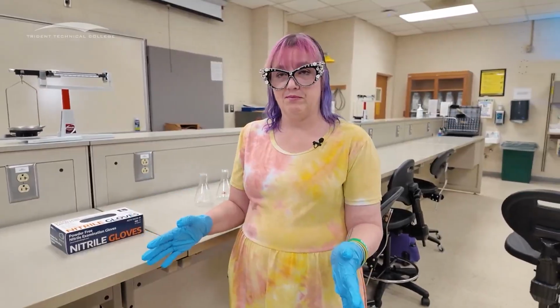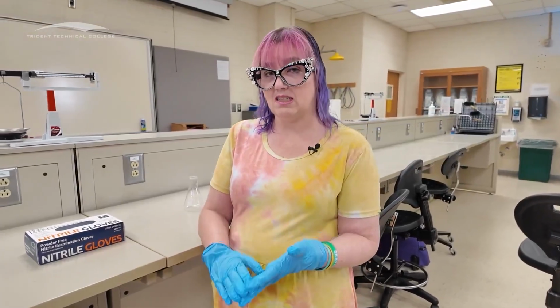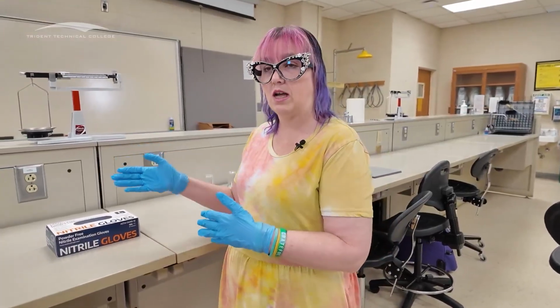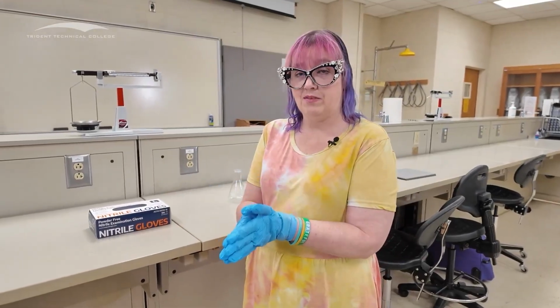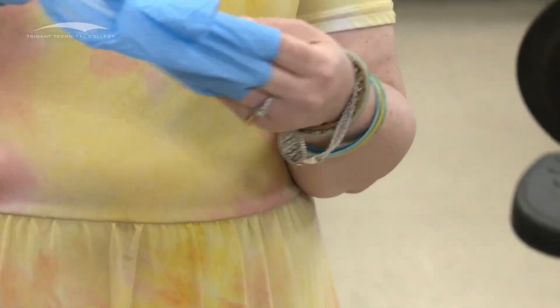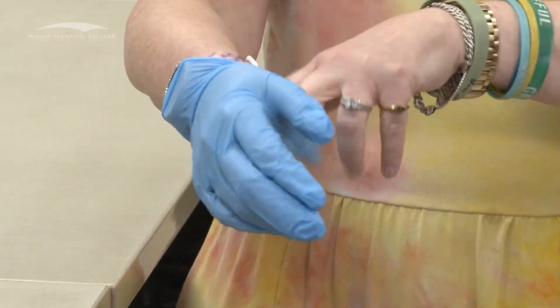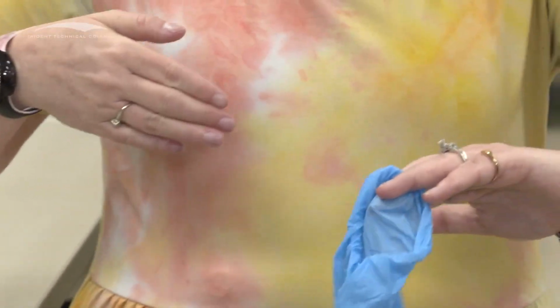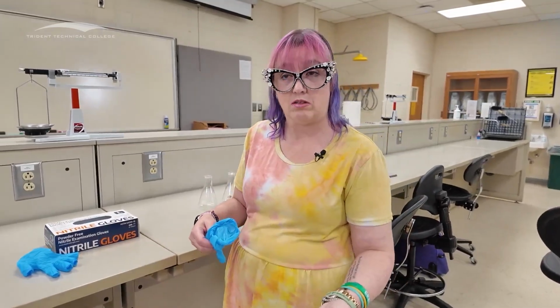When I'm in the lab and I'm working with these gloves, everything is fine. If I have to leave the lab for whatever reason, I need to go to the bathroom, I need to take a phone call, I need to eat something, I need to do something outside of the lab, including taking a drink, then I need to take these gloves off. So if I'm going to take these gloves off, I can take the first one off fairly easily, right? Fairly simple. But when I go to take the second one off, I want to hook my fingers inside of it, grab a hold of the inside, and then pull it off like that so that I'm holding the inside when I'm dealing with it, not the contaminated outside part of the glove.